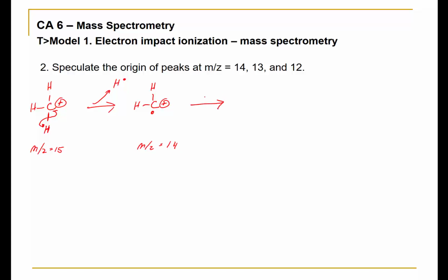Of course, this process can be repeated again. As you notice in the spectrum, fewer and fewer particles actually exist as these fragmentations continue. And so again, what would happen is a single-headed arrow to that hydrogen, a single-headed arrow to the carbon.